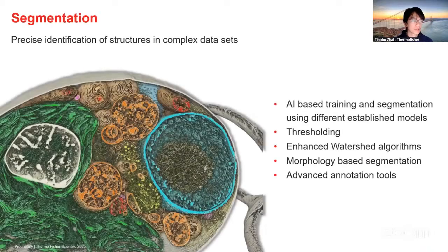After these steps, here comes the critical part, and many times the most time-consuming part. For virtually all analyses, there will be a certain defined region of interest. Those regions or structures of interest are usually buried along with other unrelated background or irrelevant structures. So being able to pinpoint and highlight those key structures proves to be very important.